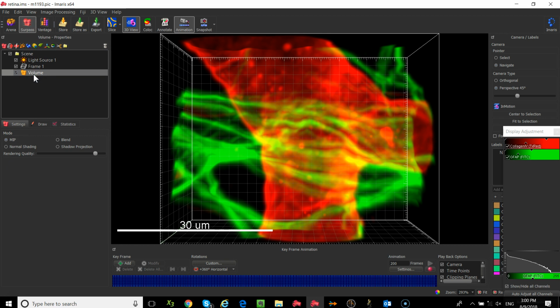Okay? The volume object, once you click on it, has the 4 different rendering modes that we talked about this morning. Okay? So by default, it opens up in a maximum intensity projection, but we discussed that that can make it look very flat and 2-dimensional. So I want to show you how we can take the other rendering modes and make the data look more 3D. So, just before we do that, one other dialogue.